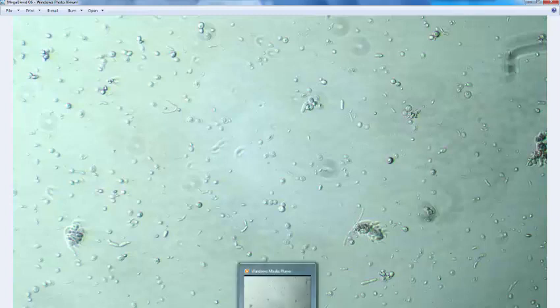And quite probably these are streptococci bacteria groups. And if we do go back and have a look at the motion view, I'll just pull this back and we can get a feel for the view as it's running.